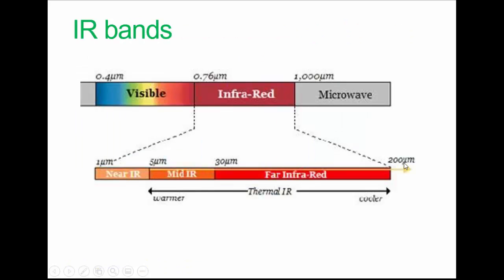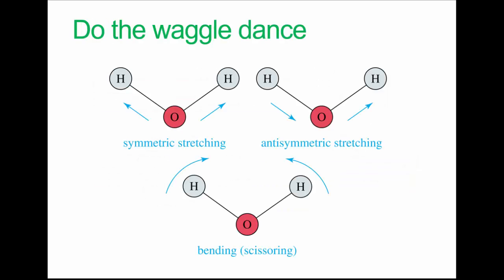The infrared region is divided into three sub-regions: the near, the mid and the far infrared, with the near infrared being closer to visible light. They're all used in analytical terms, like all of the electromagnetic spectrum. This is how it works. Again, in the Learn Sci resources, some videos on this.